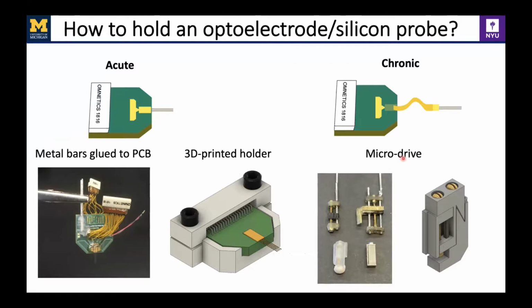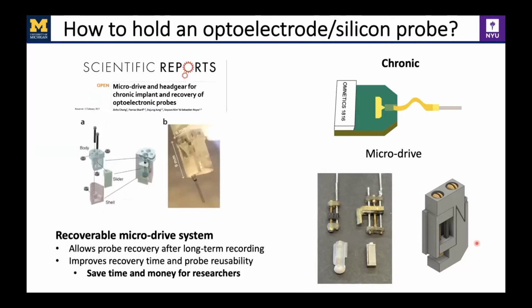And for the chronic probes, here you can see the very original handmade $1 microdrives. We have a 3D printed version, a metal version from companies or from Janelia researchers. And then we also developed a recoverable microdrive. So, what is a recoverable microdrive?